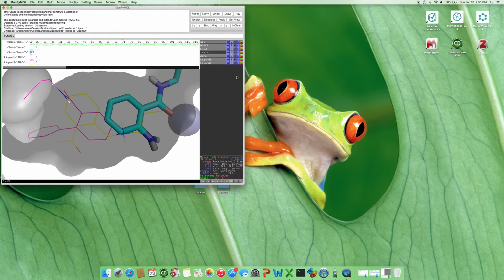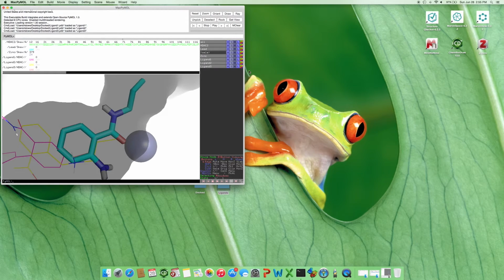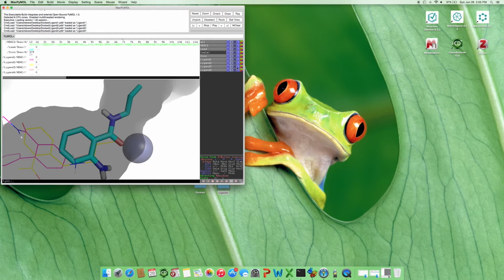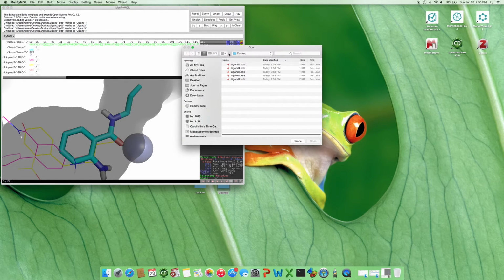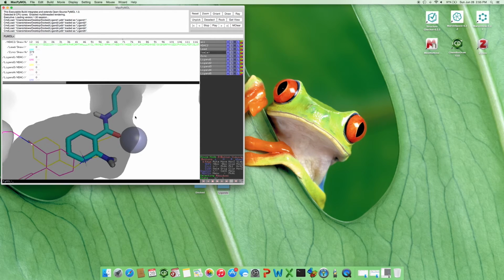You can see that each ligand we select is populating the list on the right with another tab and is also populating the visualization window with another wireframe model. Each of the tabs on the right is selectable, and so you can overlay any of these that you would like to compare them and try to get some idea why PyRX predicted the rank order that it did.